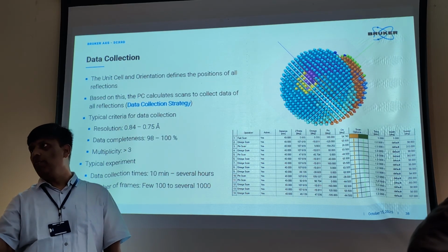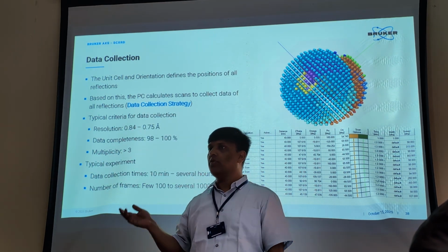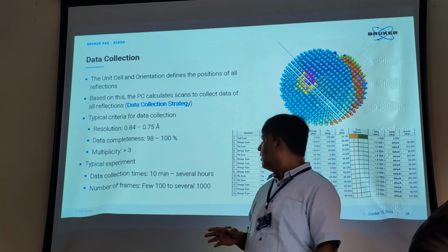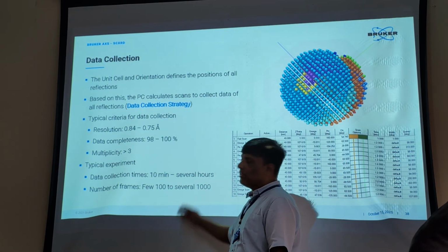Okay, so you simply cannot say, I have put 60 seconds and then I am doing it. No, it doesn't work like that. You should see the diffraction spot, then you can say. Okay, so these are the criteria for data collection. As I told you, it can take from a few minutes to a few hours.